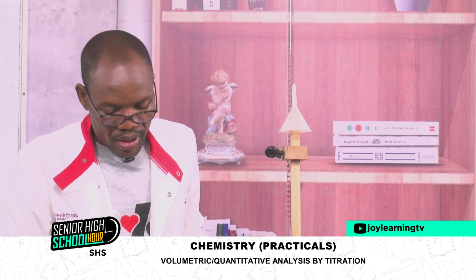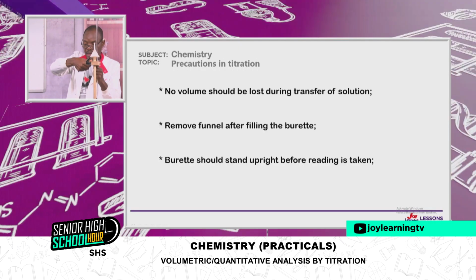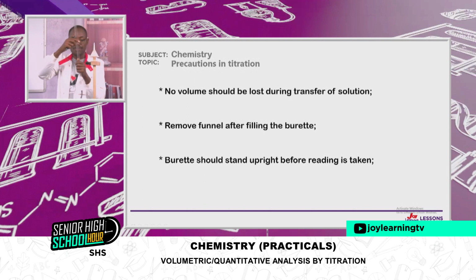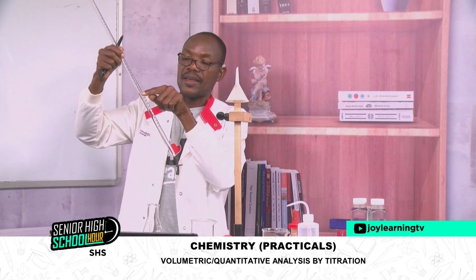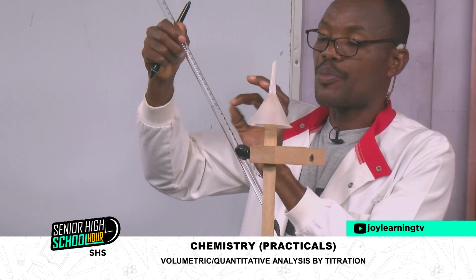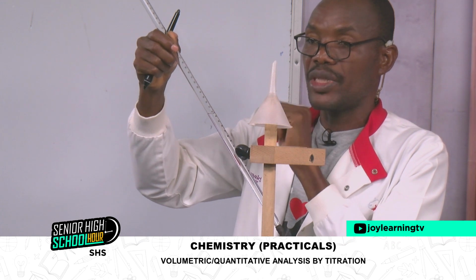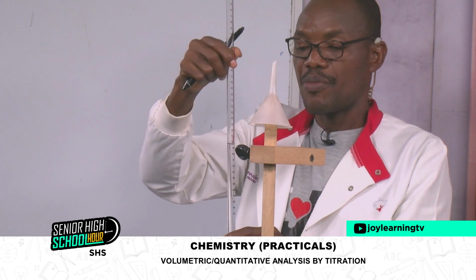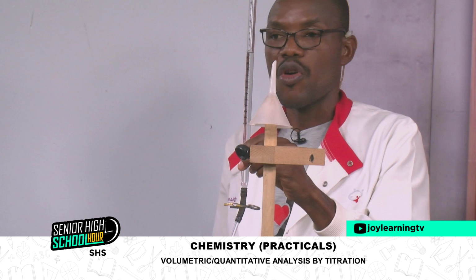Burette should stand upright before taking a reading. So it should be upright. If it is like this, you are reading, it may affect. That's why we said that incorrect approach to reading the burette will affect your readings. That is the source of error. So always make sure that the burette is upright before you take your reading.